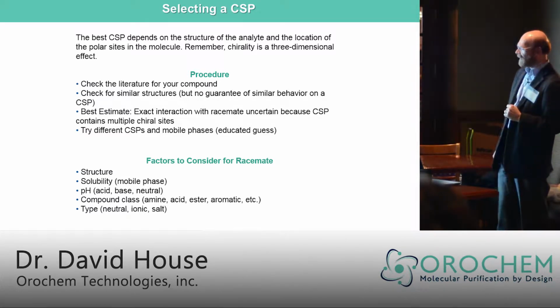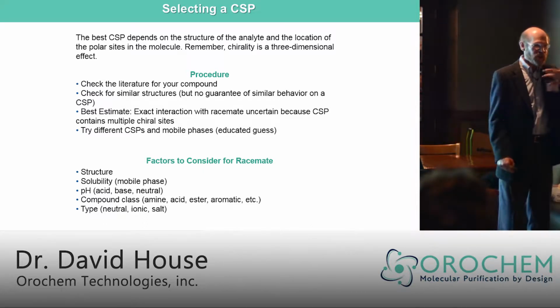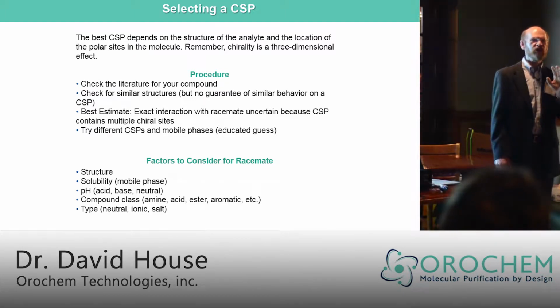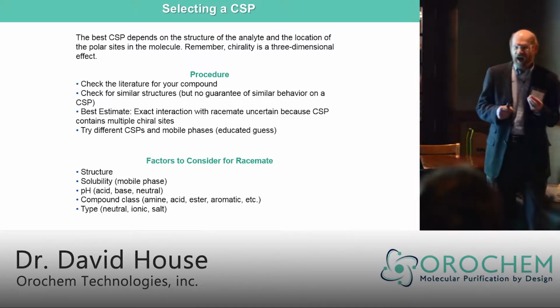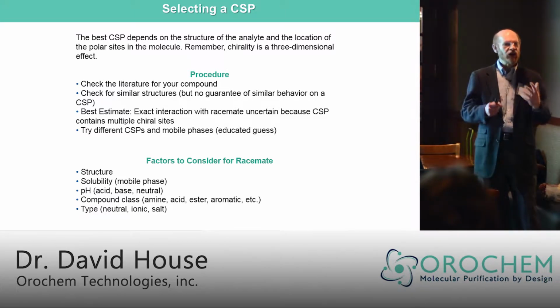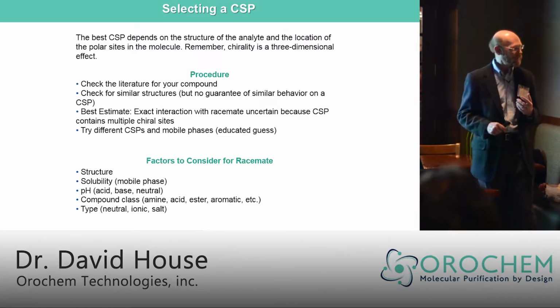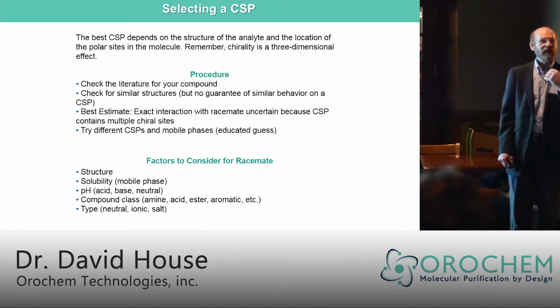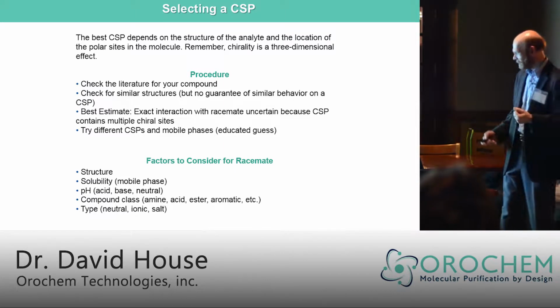Unfortunately, it sees nothing. Had it really shown up, you would see 3 long chains of chiral stationary phase, which has like 12 units in 3 chains. So it represents a very small amount of the chiral stationary phase. However, it represents hundreds of chiral sites, all capable of interacting with that one little phenylethanol down there. So that's why it's hard to tell a priori what the separation is going to look like, whether it'll be effective.